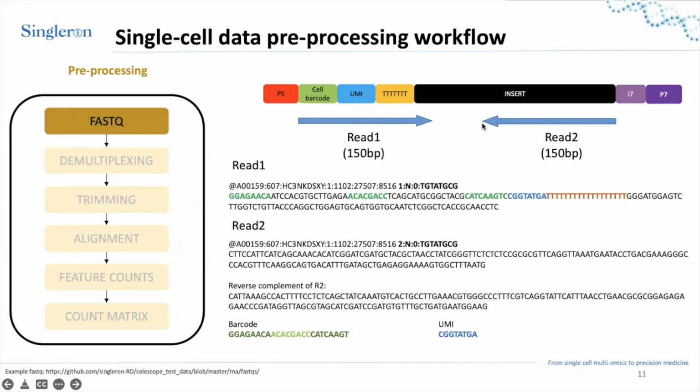Then there's another scenario where it may be used to improve the quality of the cell calling, but at this moment, all of the sequences after the poly T are not used. Part of it, I suspect, is because sometimes for read 1, after the poly T, we will see a drop in the quality scores.